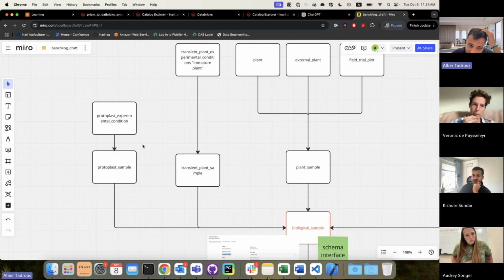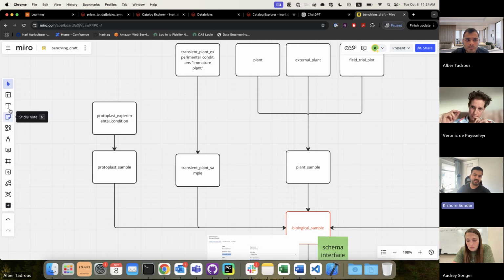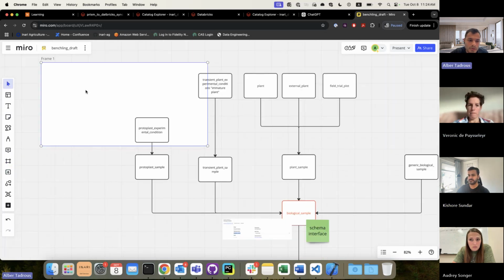Okay, isn't this in LabVantage equivalent to what they call DNA sample? No, it's not equivalent. Okay. So is this the one where they remove the cell wall and then do the transfection? Yes, that is this. And that is what product is requesting from science when they want to, for their transformation, test your guides for their efficiency in a quick system first. And that is what we do for them. So basically this cannot become a plant even if you let it grow. No. Okay.